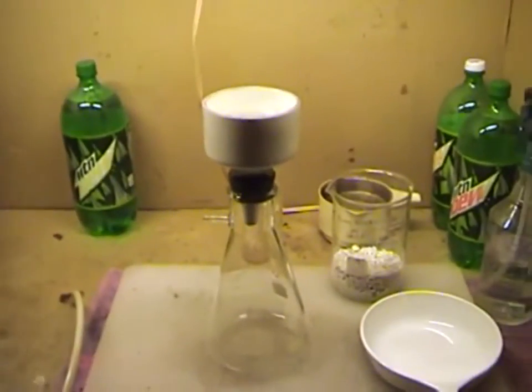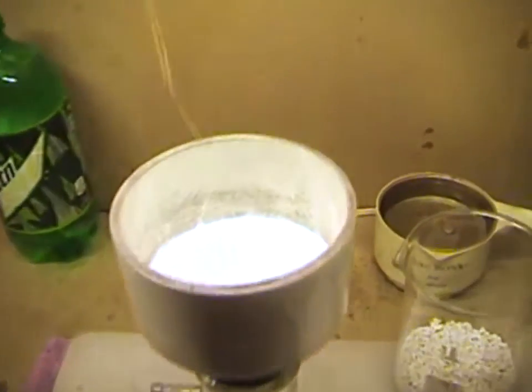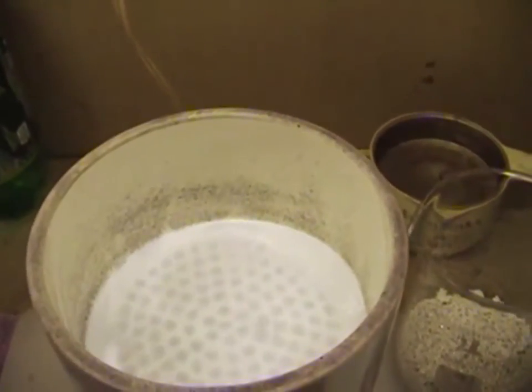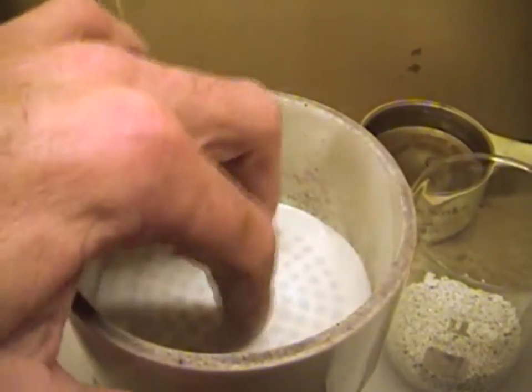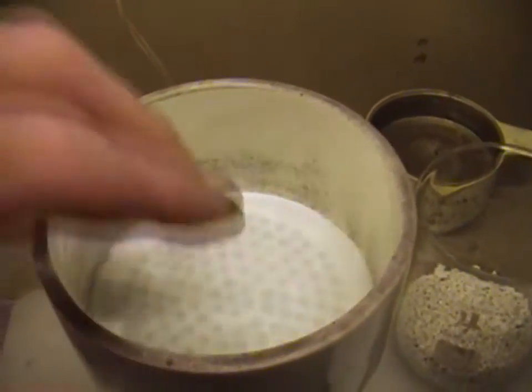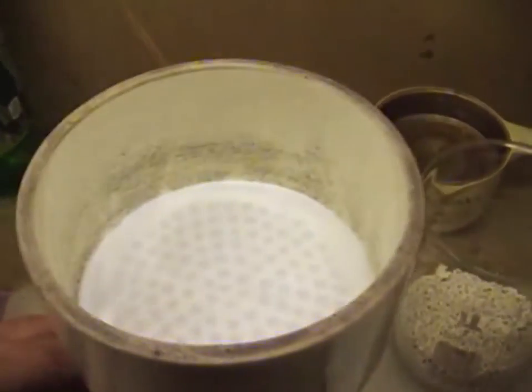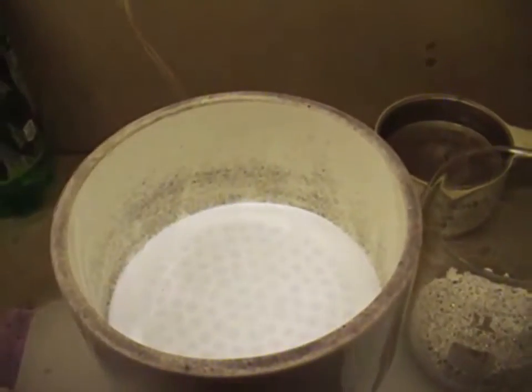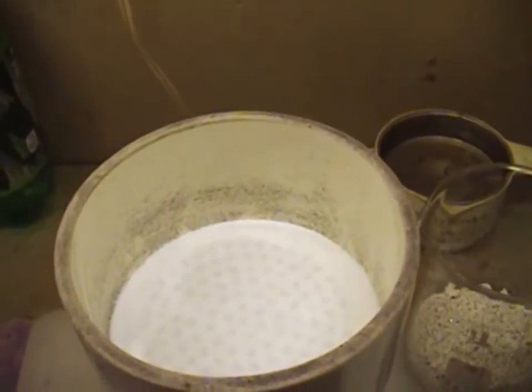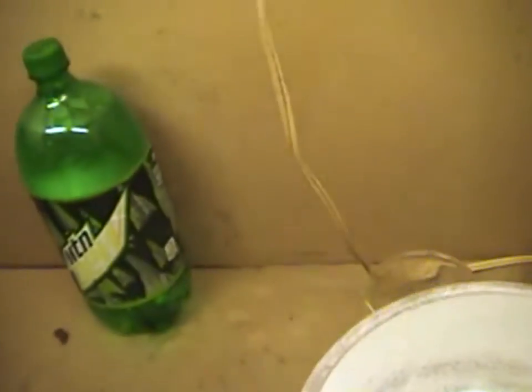I'm going to show you how to set up your Buchner funnel and how we're going to clean our crystals. First, I've taken two filter discs — I always use two filter discs — placed them in the bottom of the funnel and wet them with a spray bottle. I want to apply vacuum at this point to get a good seal of that filter paper against the bottom of the funnel. You wet it, apply vacuum, and it will suck itself down.